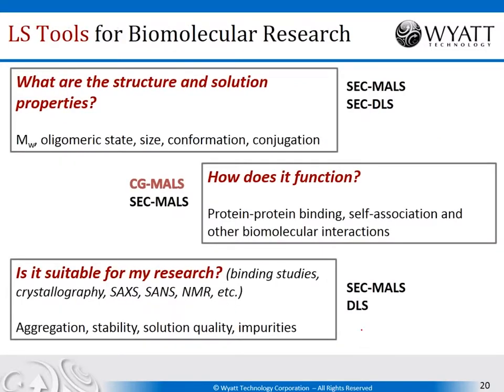And so, to summarize, here are the answers to these questions. How do we determine the structure and solution properties, the functionality, and the quality of the proteins and biomolecules using light scattering? Here are the techniques: SEC-MALS with DLS as well, and CG-MALS to answer these questions.